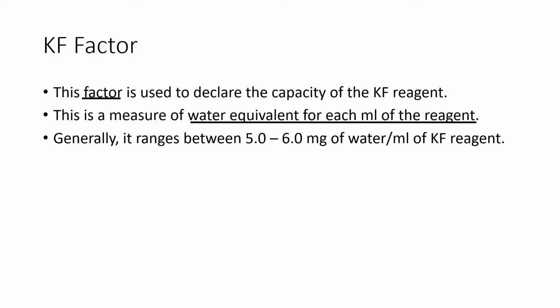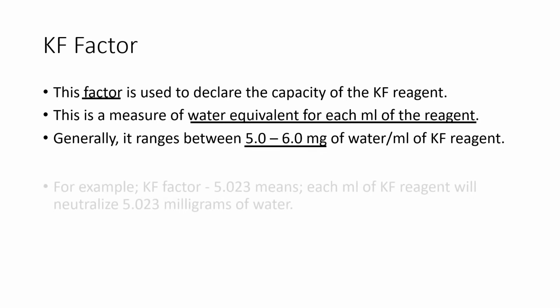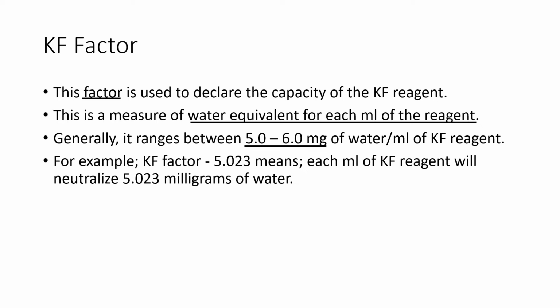Generally, it ranges between 5 to 6 milligrams of water per ml of Karl Fischer reagent. For example, if the Karl Fischer factor is 5.023, each ml of Karl Fischer reagent will neutralize 5.023 milligrams of water.